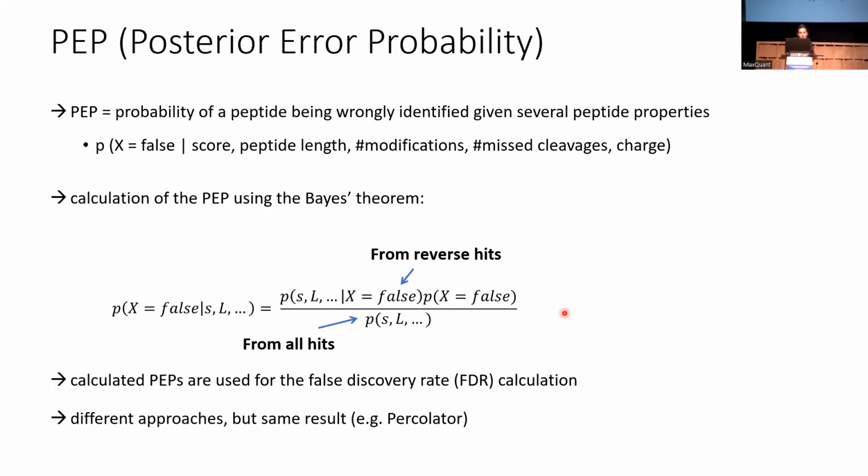Perhaps another tool is doing that, and maybe in the next Andromeda 2.0 you will be able to choose whether you want to use machine learning or this posterior probability score. Actually, we already have the machine learning way for the DIA algorithm, but not yet for the DDA, but soon.